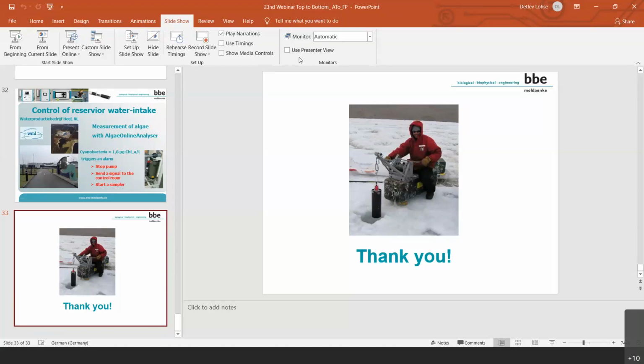Here we have a small angle because we have the backscattering, so it is not easy to transform it, and maybe it's impossible. But as we did this with the formazine, and we know the amount of formazine that we use for the calibration, we call it, of course, FTU.